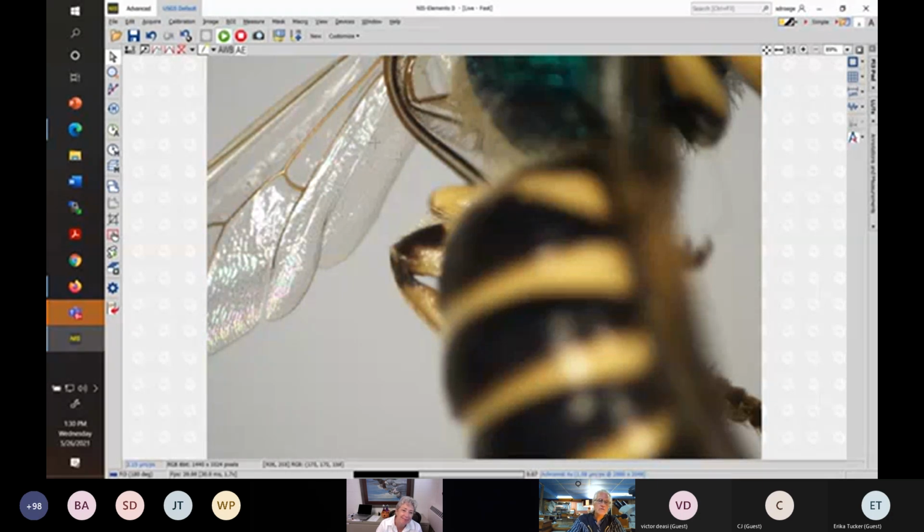So this will fold over, and it gets very confusing because you can't see that fold very well. And it's like, I only see this vanal lobe. So bottom line, often really difficult to observe this area because of the presentation of the character by the bee. But on the other hand, it's used by taxonomists all the time because it is often highly discriminatory. So some species have very short jugal lobes, very different from something like this, where it's quite an extensive jugal lobe to vanal lobe ratio.